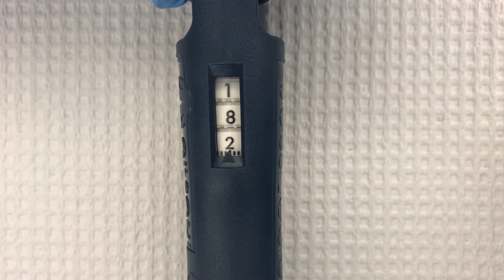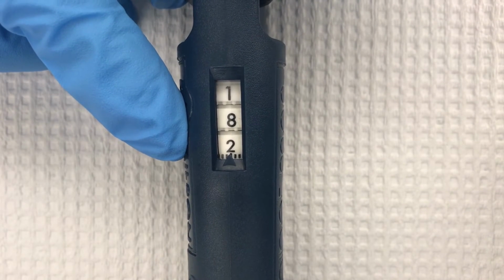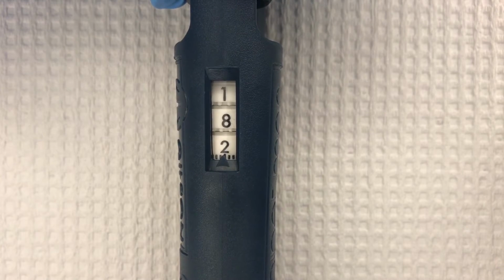This is a P200. The upper digit corresponds to the hundreds place. The middle digit corresponds to the tens place. The bottom digit corresponds to the ones place. This pipette is set to pick up 182 microliters.